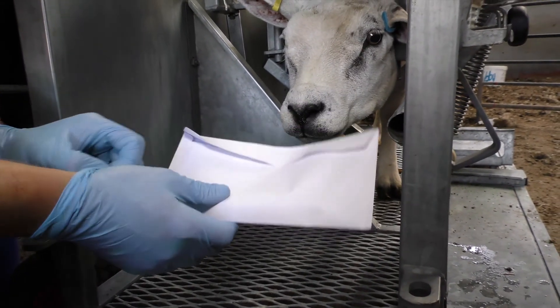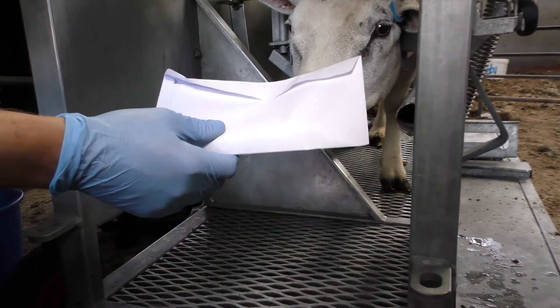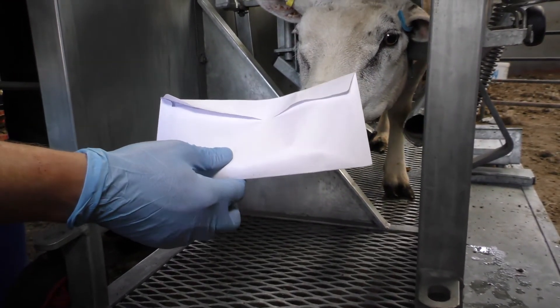And once we're done, remember to take the gloves off and put a new pair of gloves on for sampling the next sheep.